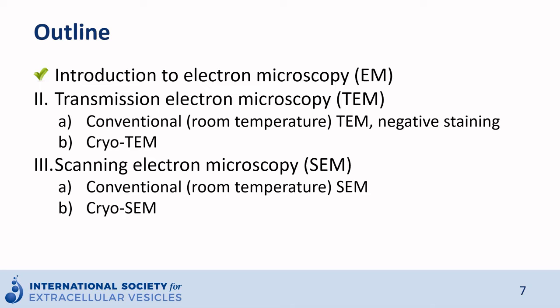After this general introduction on EM, I will present the application of transmission electron microscopy to the analysis of EV samples. Two parts: conventional TEM, negative staining, and cryo-TEM.